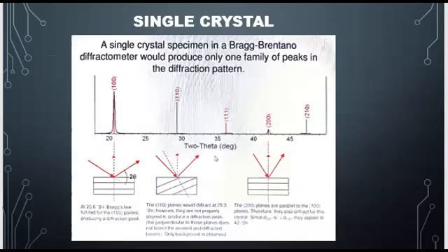For a single crystal sample, if one single crystal is being analyzed, the standard setup for an XRD machine would only show one set of peaks.